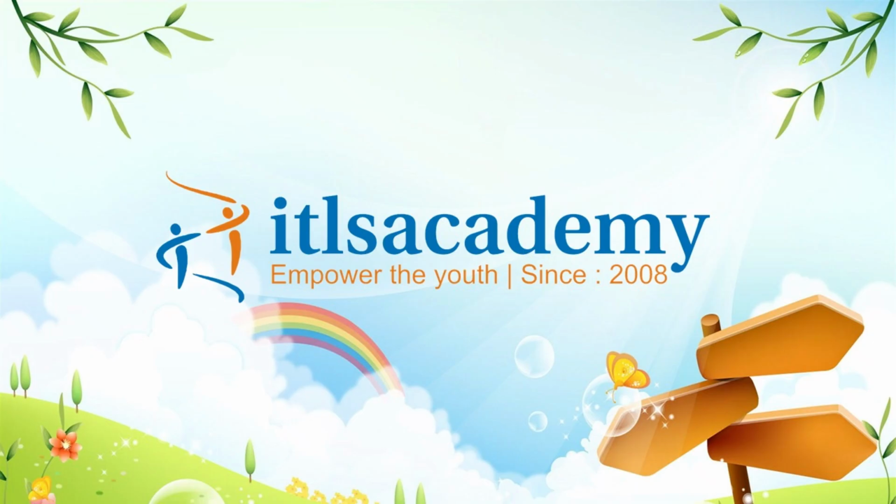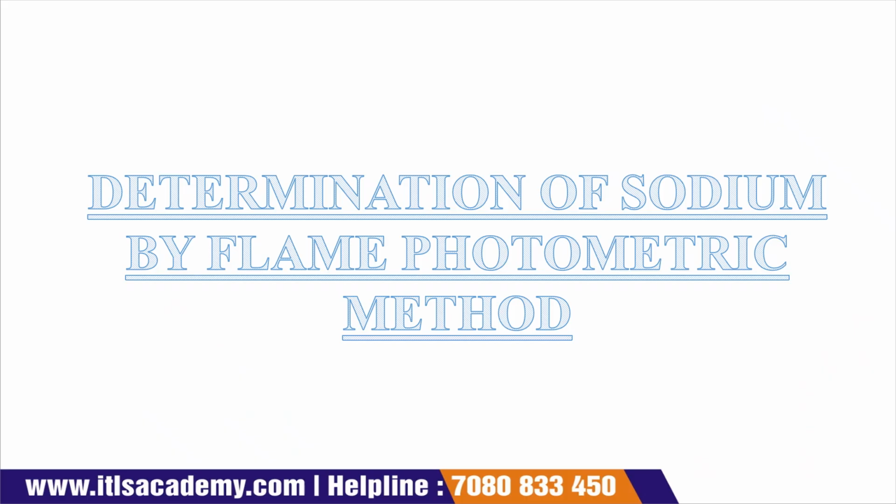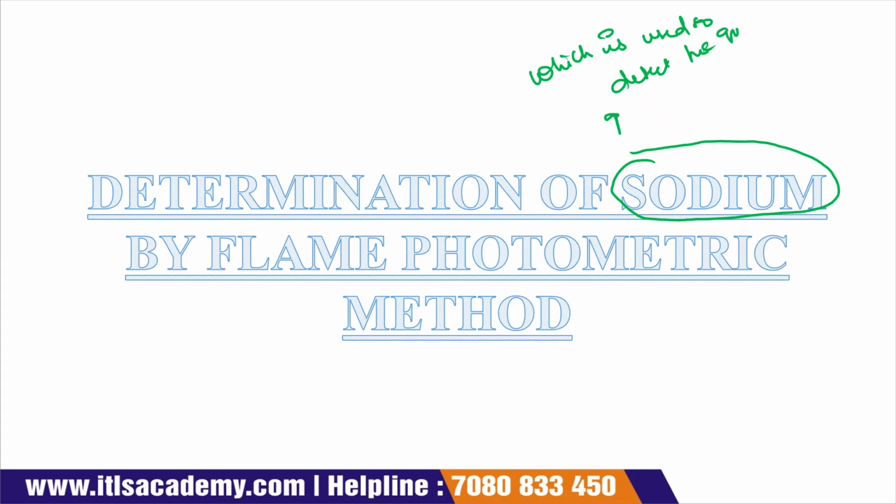Today we are going to discuss another lecture in the series of FSSAI water analysis, and the topic that we are going to discuss is the determination of sodium, and the method that we are going to use is the flame photometric method. Okay, so we all know that sodium is a compound which is used to detect the quality of the water.